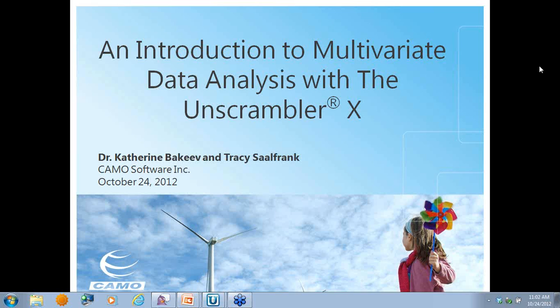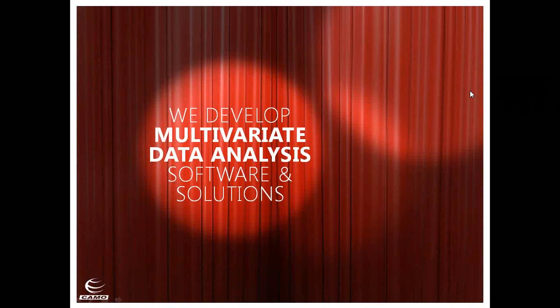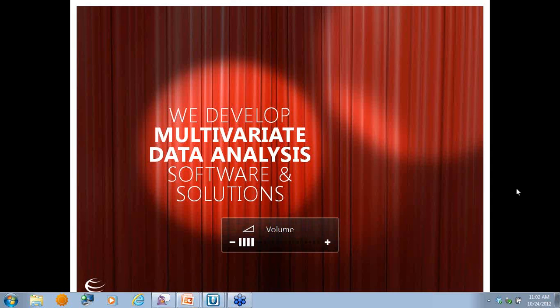While waiting for other people to log into the webinar, let me take just a few minutes and tell you a little bit about Camo. With over 25 years of experience in developing multivariate analysis software and solutions, Camo is viewed as an established and trusted market leader. Creating significant value for our customers is at the center of what we do.